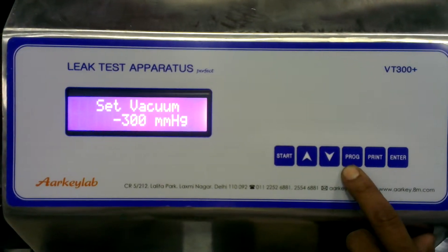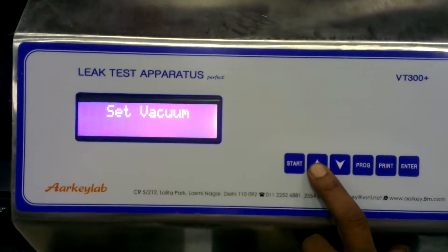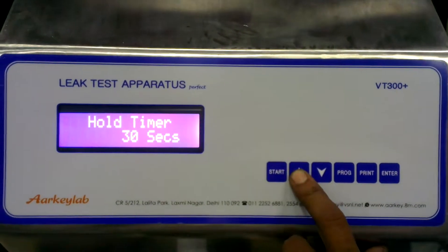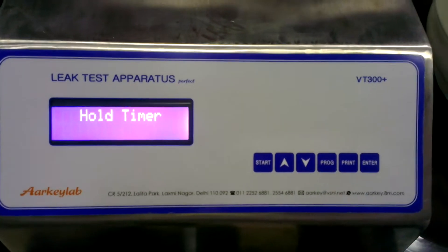Press Program. Now with the Up key, set the hold time — say 30 seconds — then press Program.